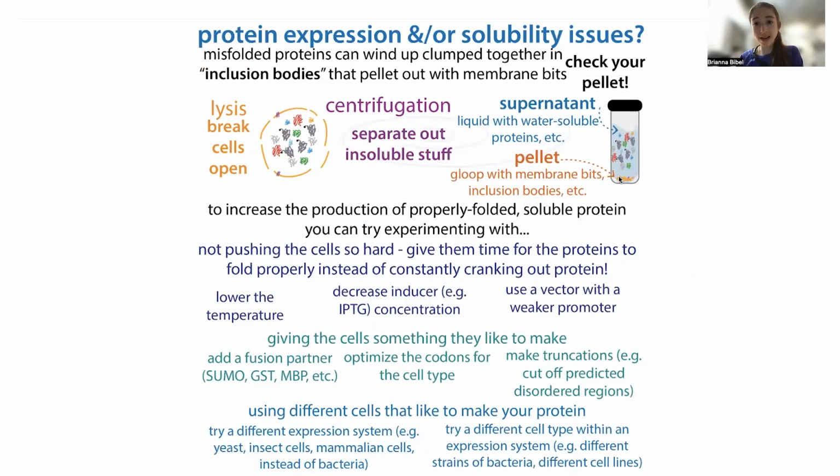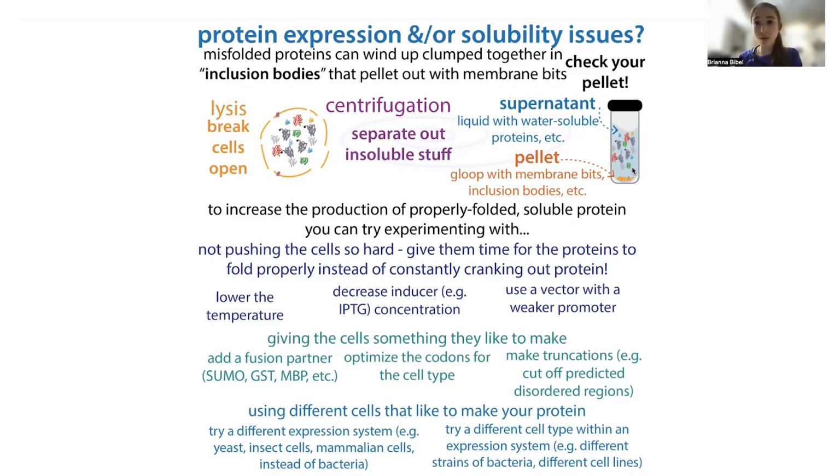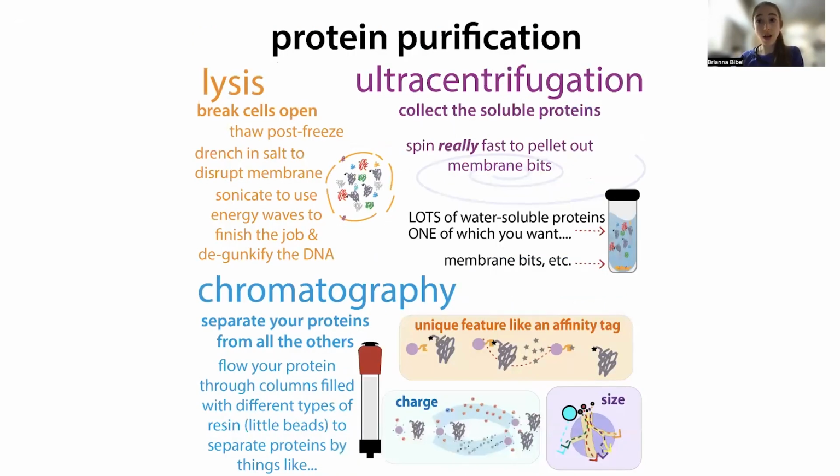And so if you run an SDS-PAGE gel on these different fractions, so on the pellet and the supernatant, the liquid above it, this can help show you if your protein was made. If you do a Western blot or something to use antibodies to detect the protein, you could see potentially, well, was it made, but it ended up in these inclusion bodies, or was it not made at all? And so both of these issues can be helped with these fusion partners.